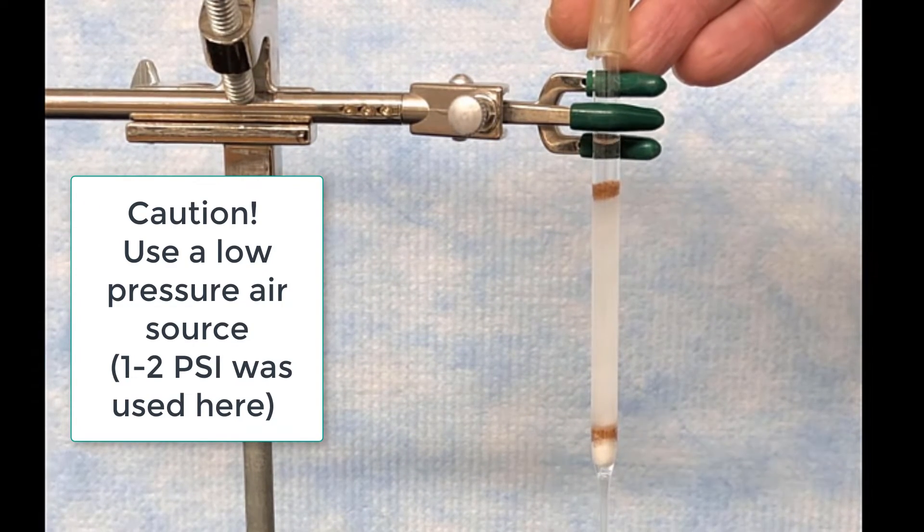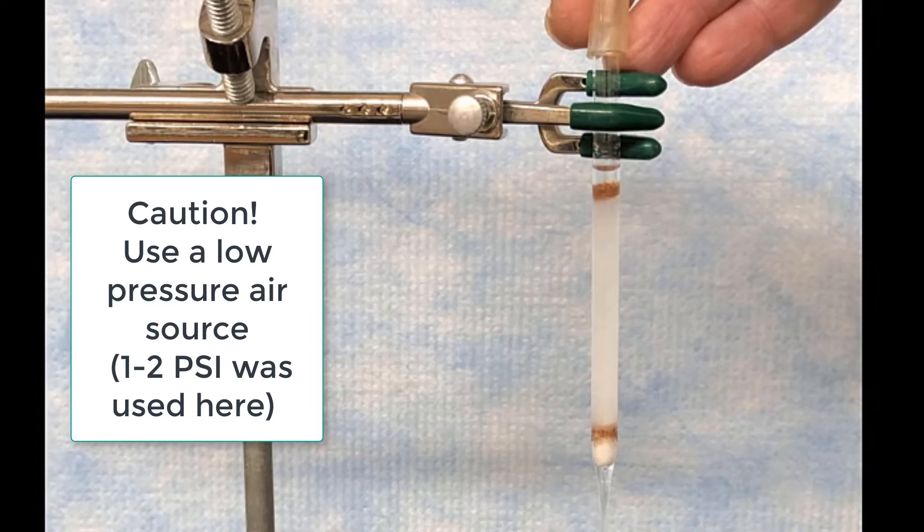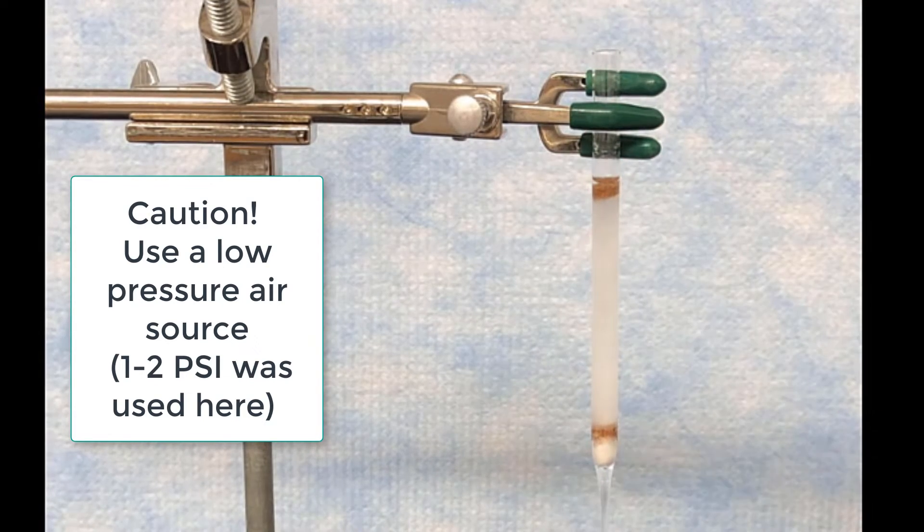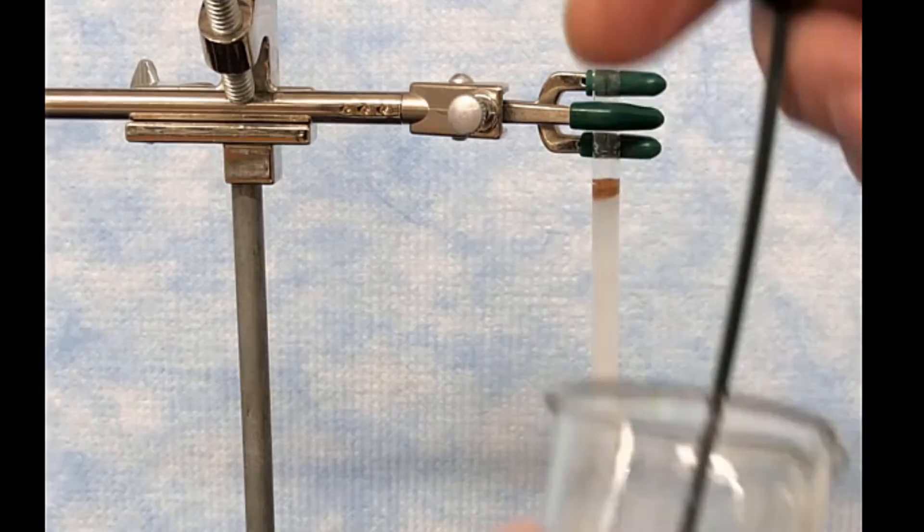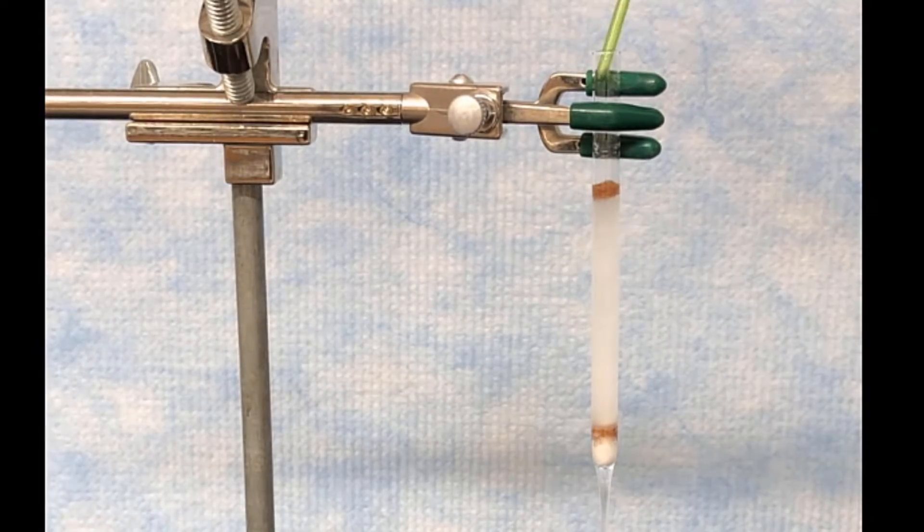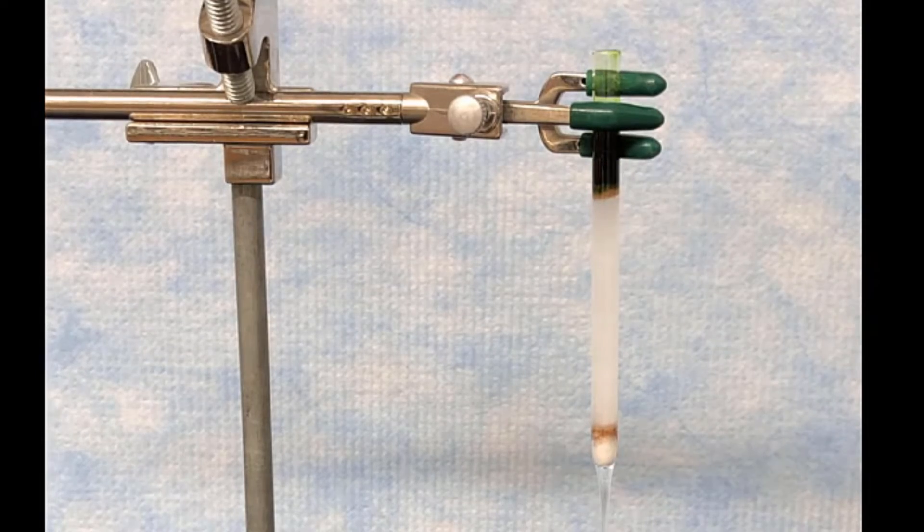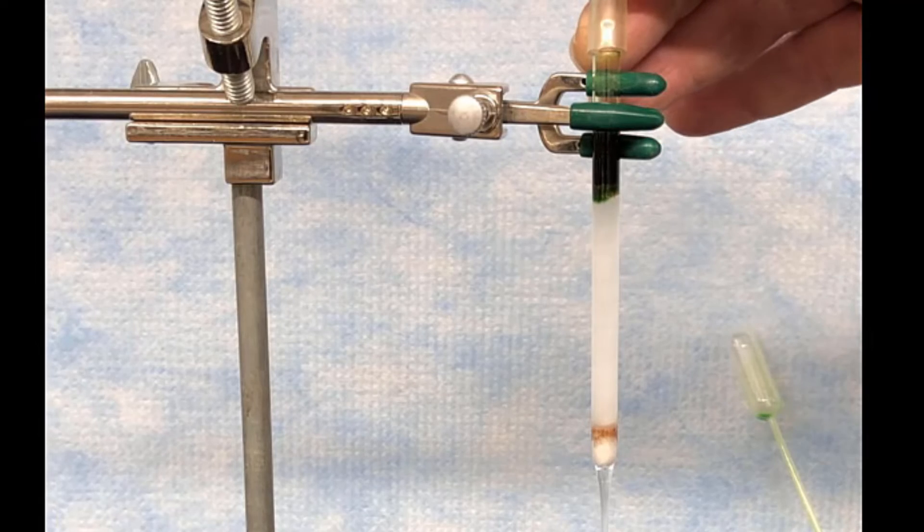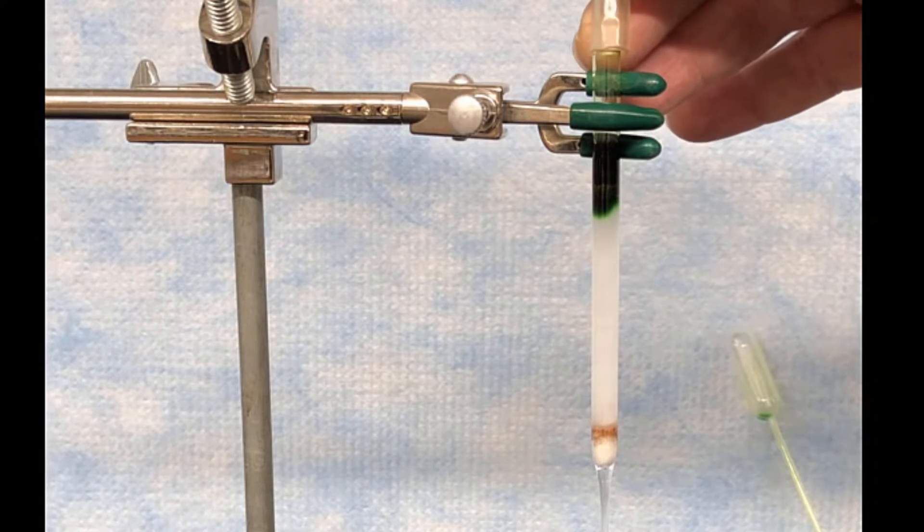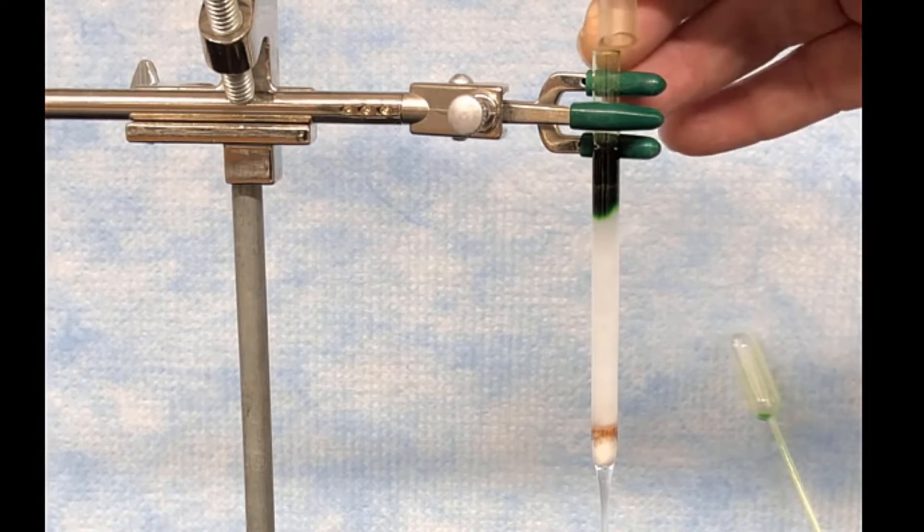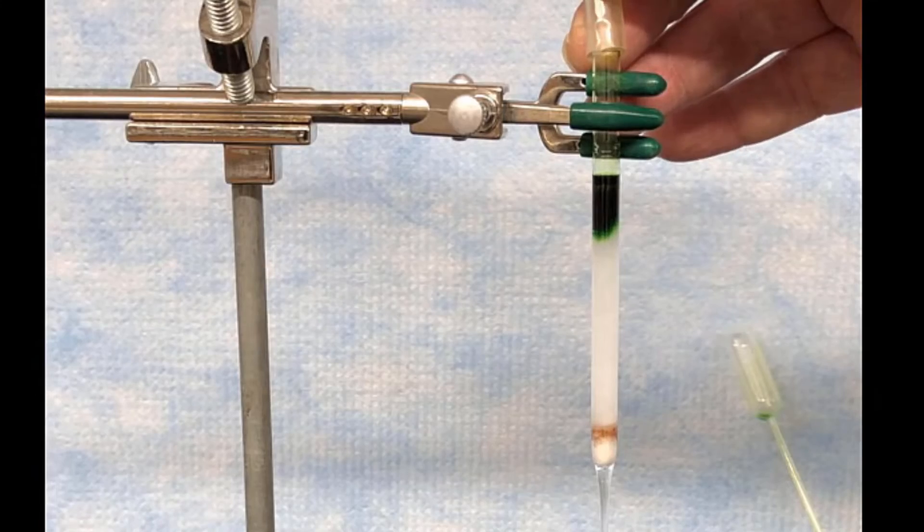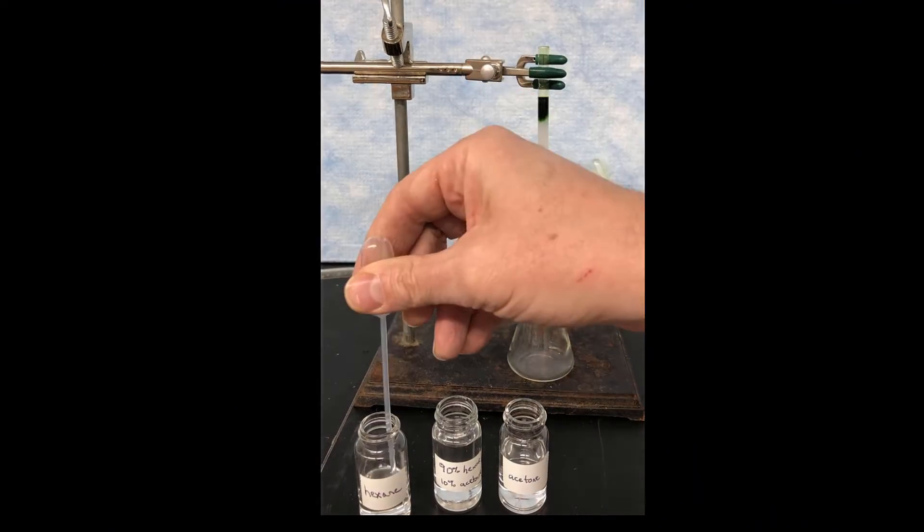But first, we need to remove some of that hexane. So this is using a gentle pressure of air, very, very gentle, to try to get rid of some of that solvent. You do have to be really careful with compressed air. You don't want to use too much pressure. You could blow up the column. So here we're putting on the crude pigment solution, and we're going to just give it a gentle push with the compressed air to push it along. We don't want to push it too far because you don't want to dry out the column.